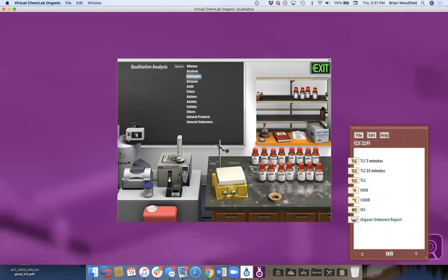So what they can do is they can create these different sections, for example, experiment 1, and then you can also go here and add a new page to experiment 1, and then they just use these arrows to navigate between their pages. And then you can also create a new section and name that.